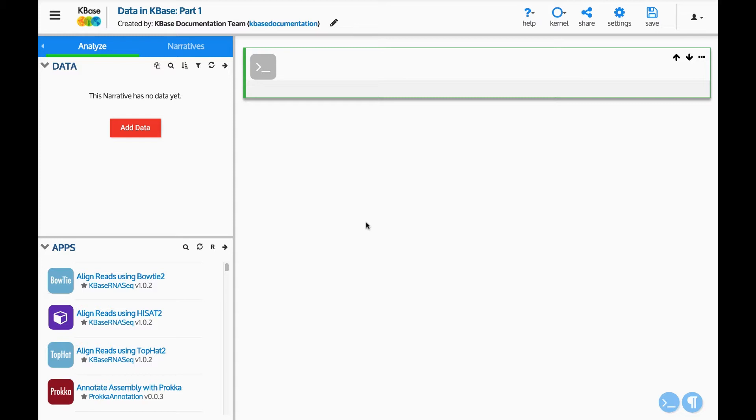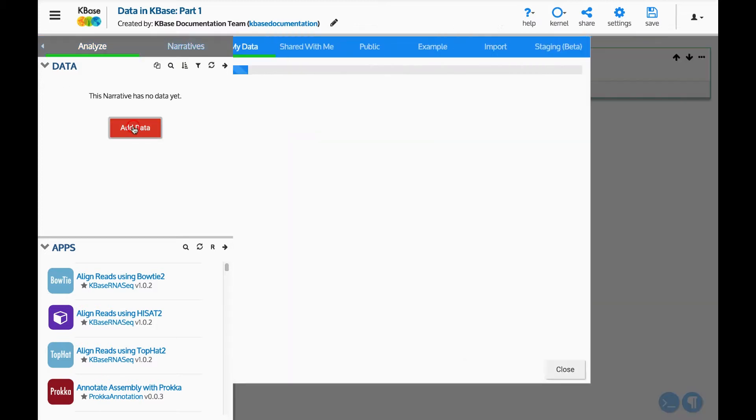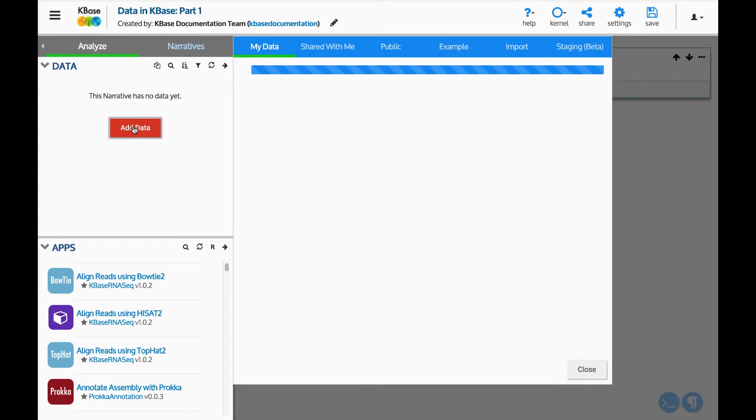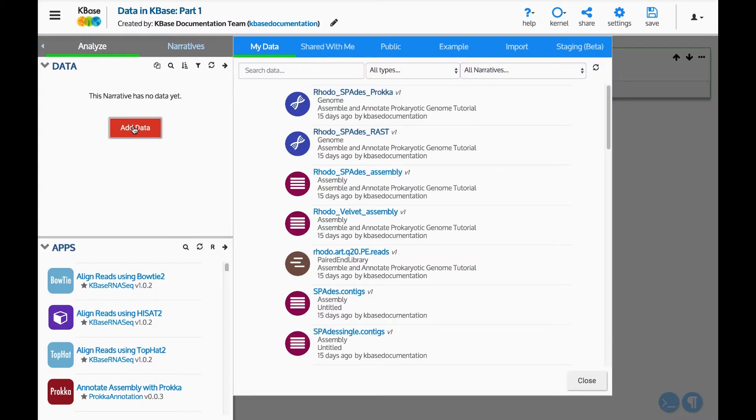Locate the Data panel on the left side of the screen. This panel shows all data loaded into this narrative. Click the Add Data button to open the Data Browser slide-out. The data slide-out can be opened or closed with the arrow on the top right.